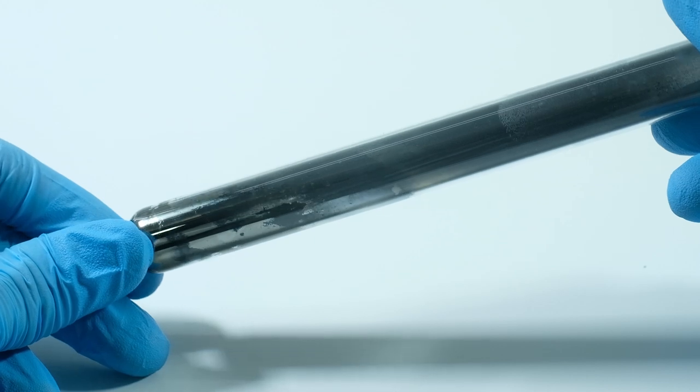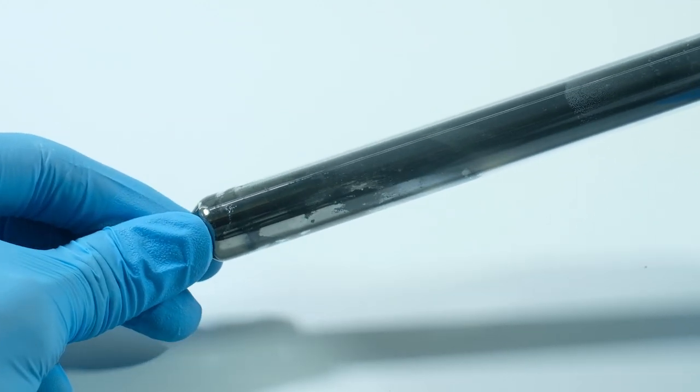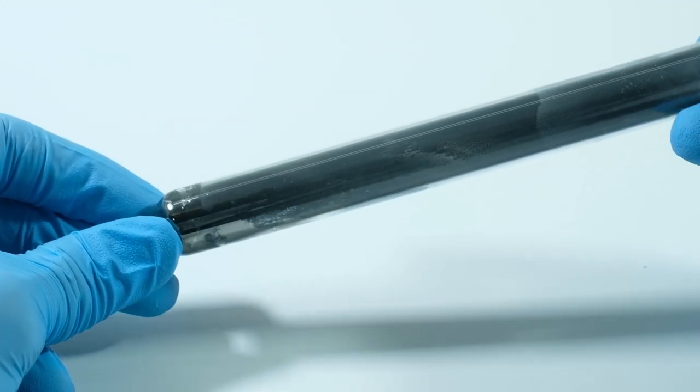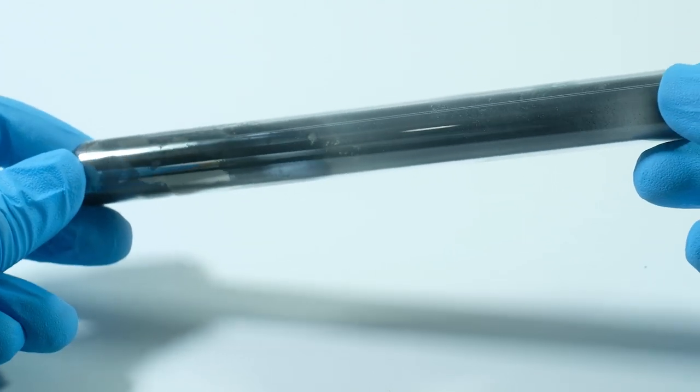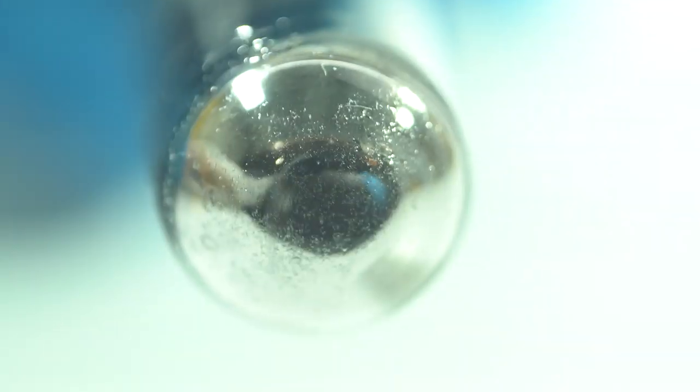After complete decomposition of chromium hexacarbonyl, we got a test tube coated with chromium on the inside. This is the main industrial use of this substance, chromium plating. Don't forget to like.